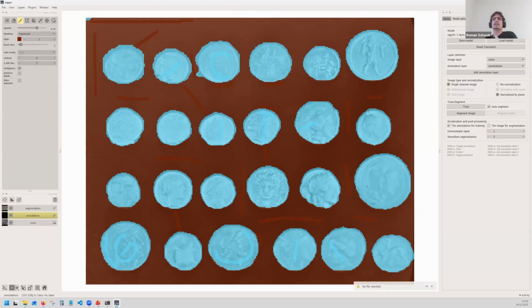So maybe if I'm using this feature extractor with this amount of segmentation smoothing and maybe some advanced settings, you just want to keep this information for training it later in another context. That would be what the YAML file is for. And then you can also save it as a pickle file, which includes also the classifier next to all the information.